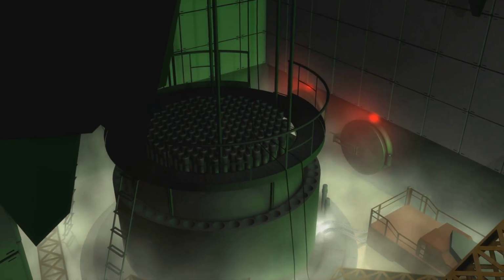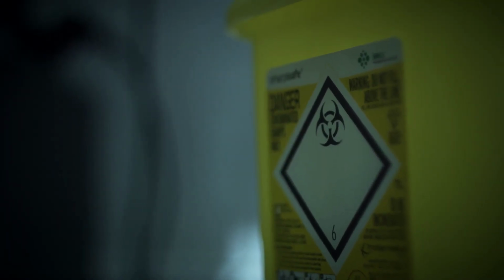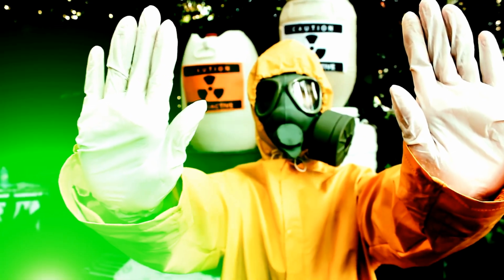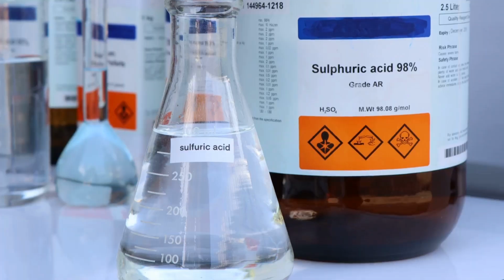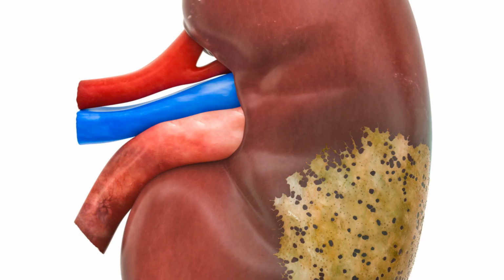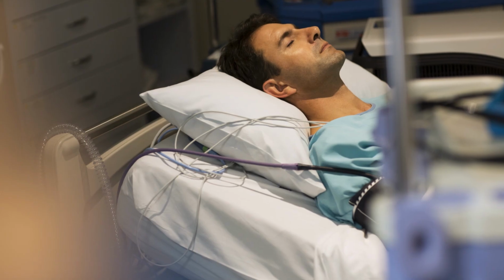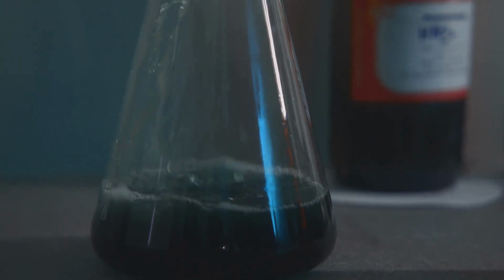Beyond the immediate dangers of fire and poisoning, there are sneakier, less obvious hazards that we need to talk about. The first one is long-term health effects from chronic exposure. This means being exposed to small amounts of solvent fumes over and over again for a long time, weeks, months, even years. Some solvents, like benzene and carbon tetrachloride, are known carcinogens. Others can cause damage to your internal organs, like your liver, kidneys, and nervous system. These effects might not show up for a very long time. It's a slow-motion danger that builds up over time.